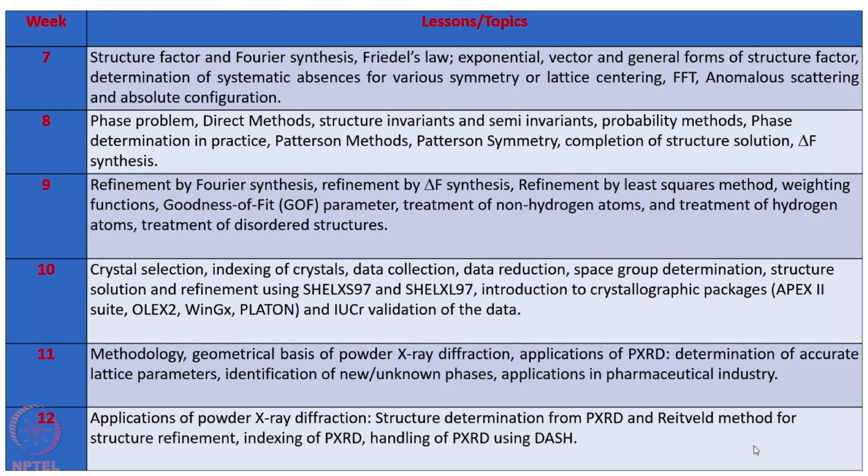Then we will introduce you to the phase problem. We will talk about direct methods, Patterson methods, Patterson symmetry and completion of structure using delta F synthesis. Then we will discuss refinement of the determined structures, refinement by the least squares method, the weighting scheme, the goodness of fit parameter, the R factors, weighted R factors and all that.